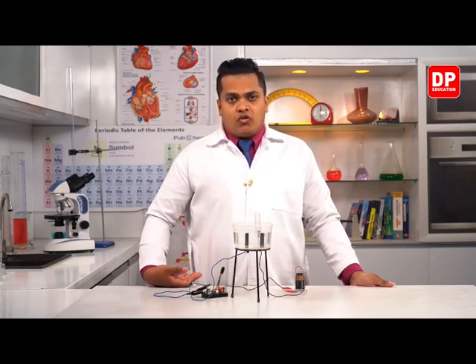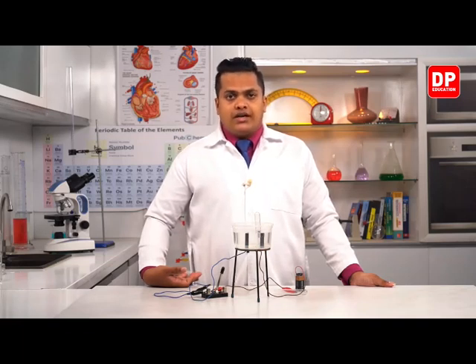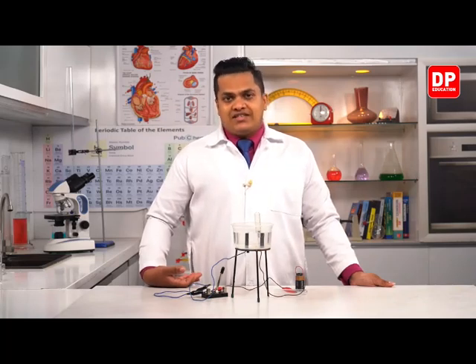If you want a clear observation, then we have to use a somewhat larger container. But however, my dear children, here the gas which is getting collected is the oxygen gas.